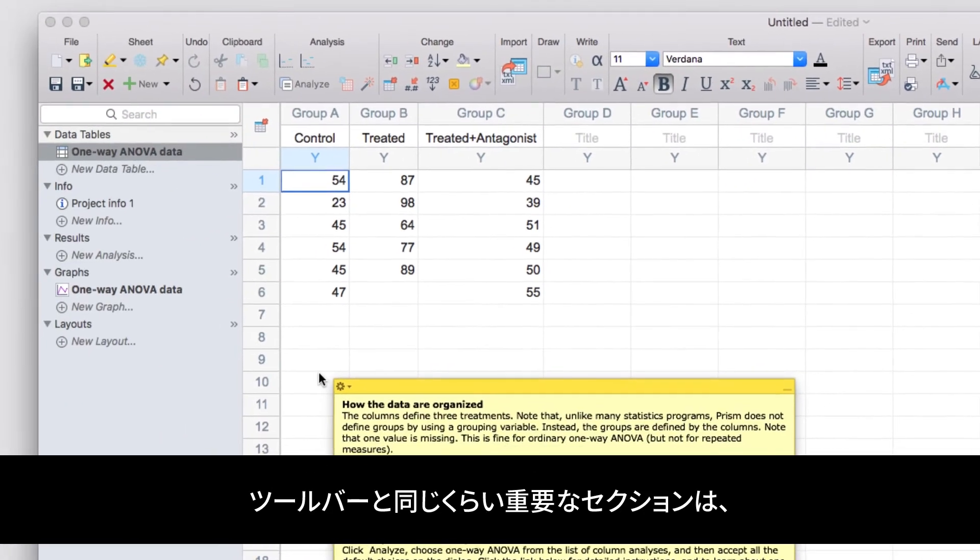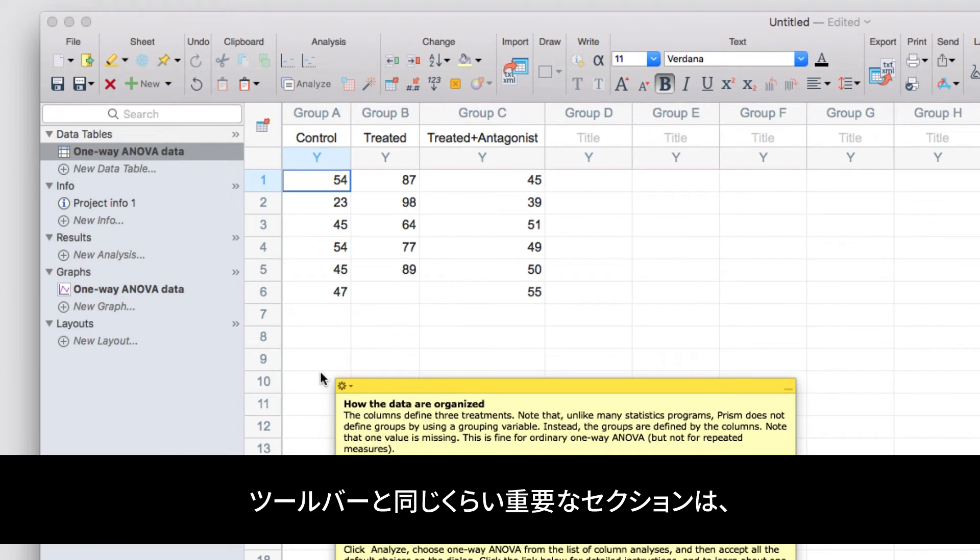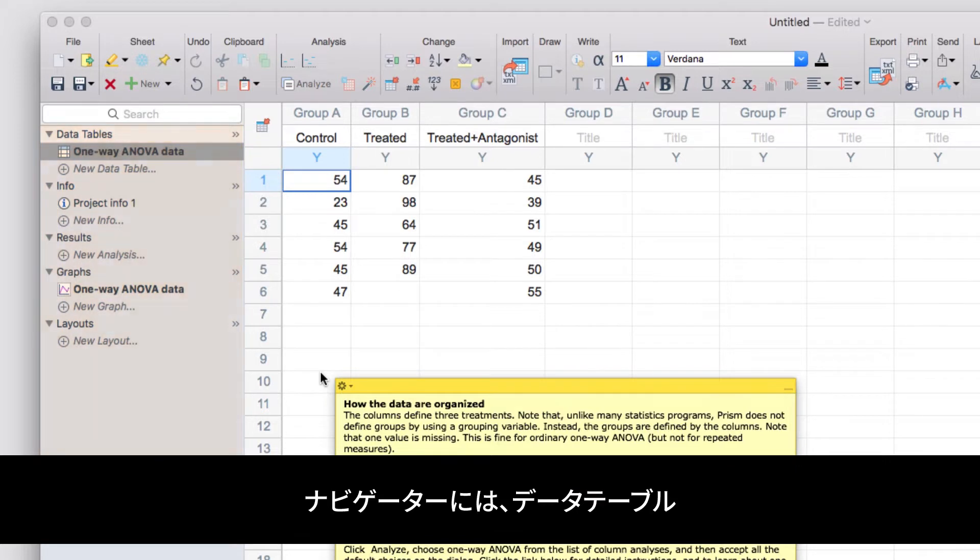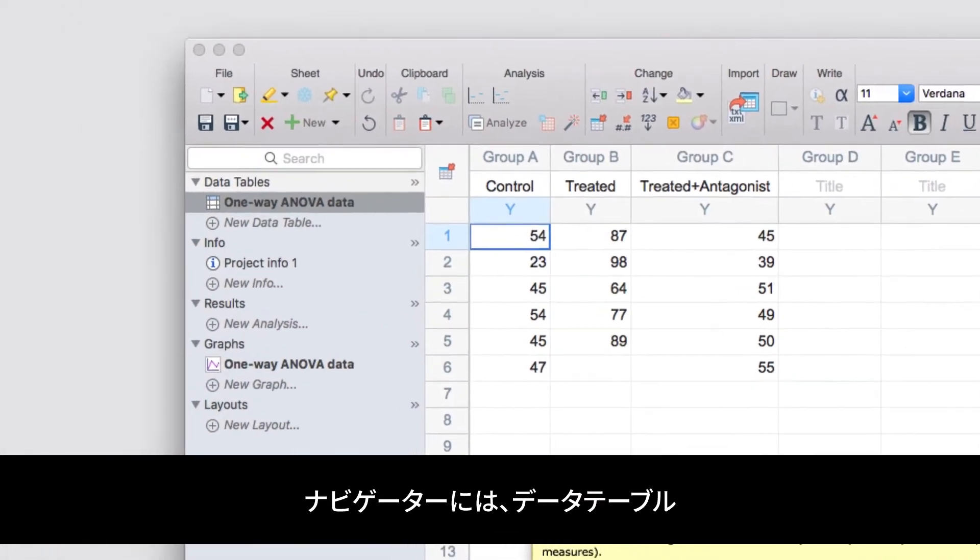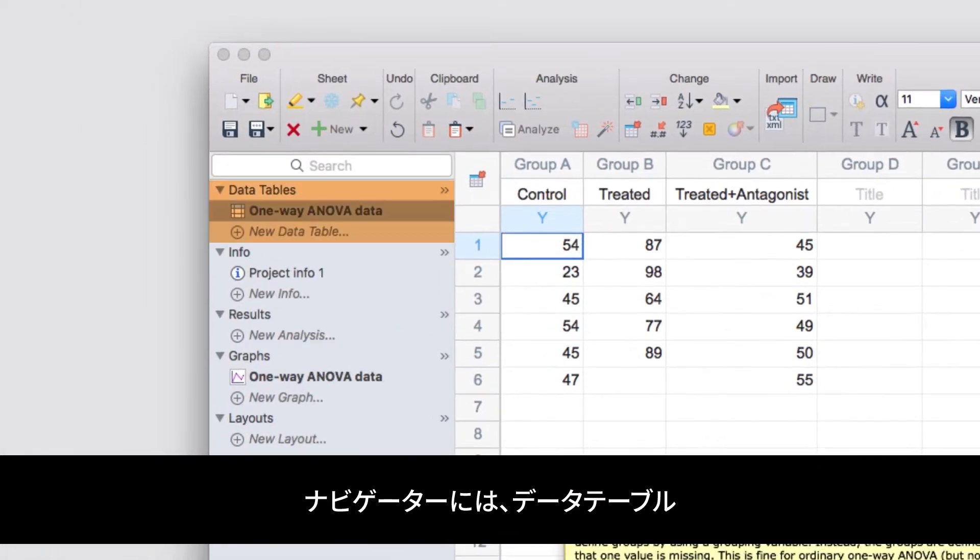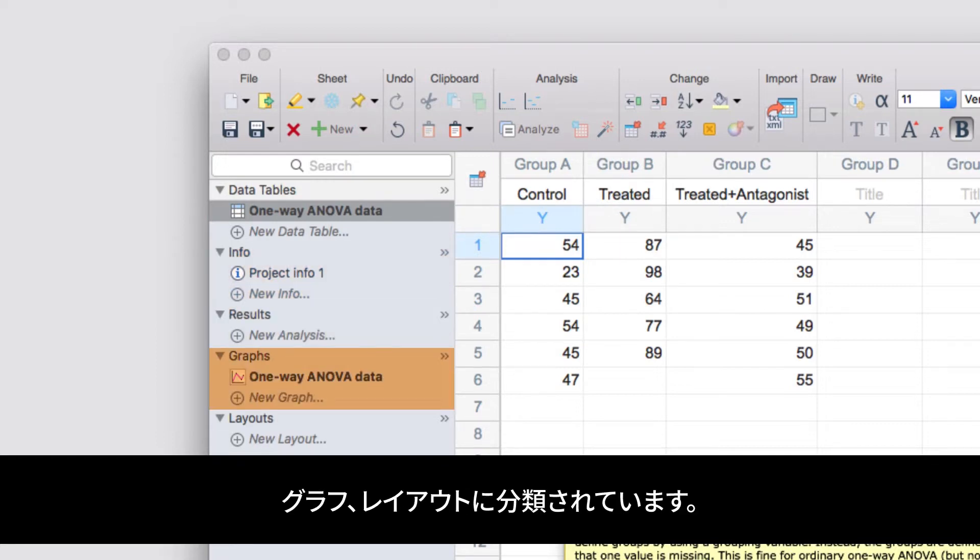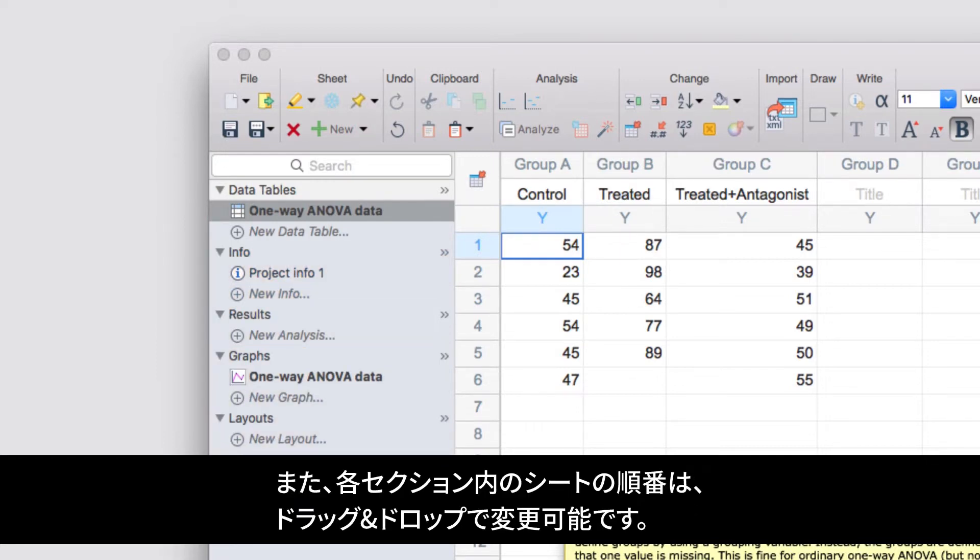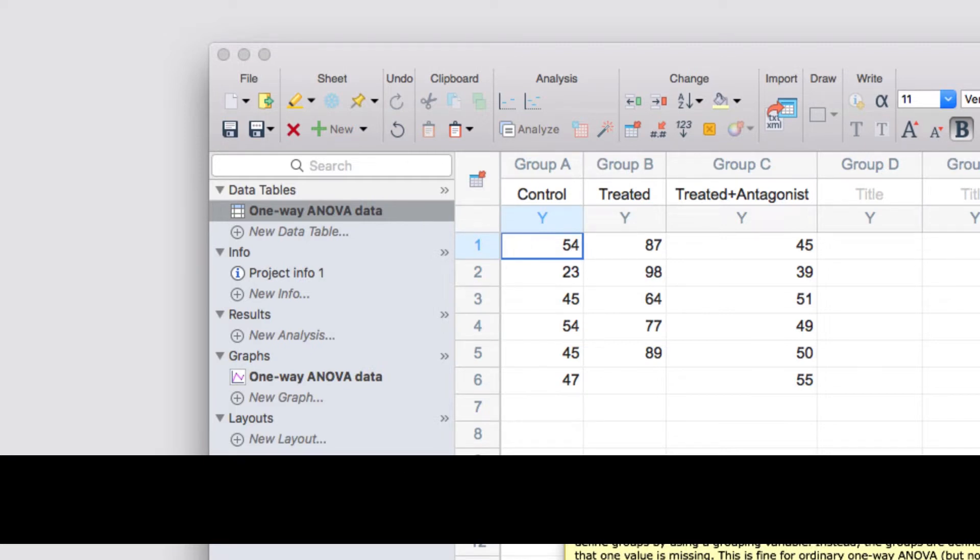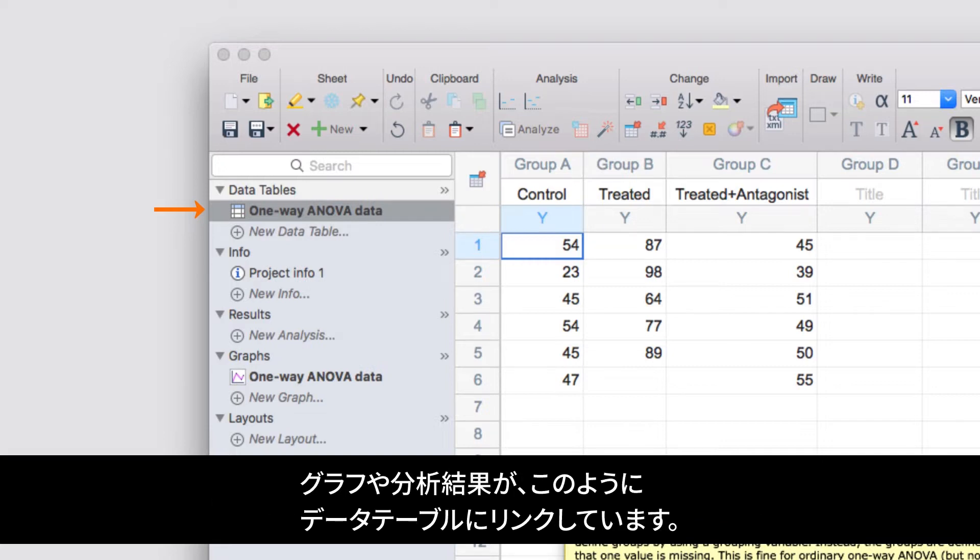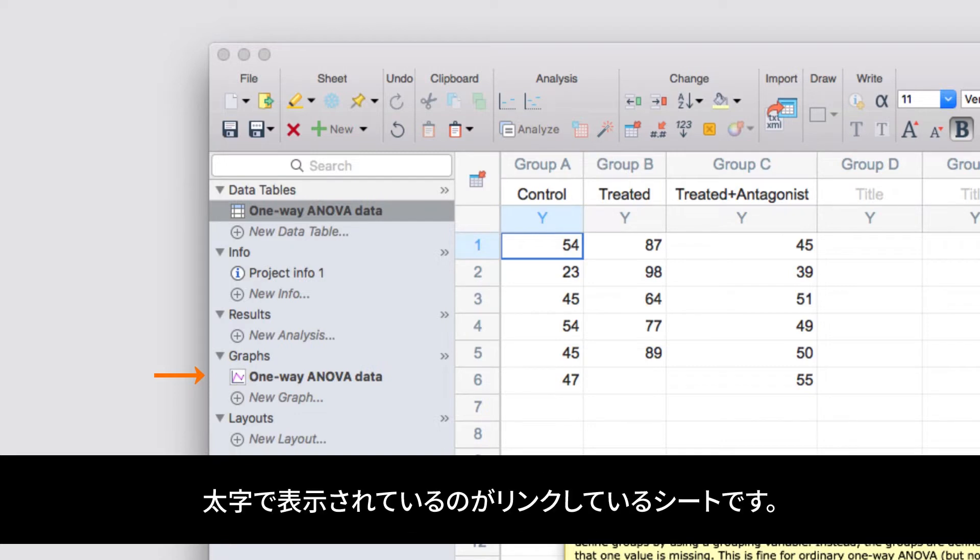In addition to the toolbar on top, the other very important section of a Prism project is the Navigator panel on the left. In the Navigator, all of the sheets of your Prism project file are organized by whether they are a data table, a project info sheet, an analysis results sheet, a graph, or a layout. And within each of these sections, you can organize the order of the sheets simply by clicking and dragging. It's worth noting that any sheet that is linked to the actively selected sheet, such as graphs or analysis results generated from a data table, will appear bold in the Navigator panel.